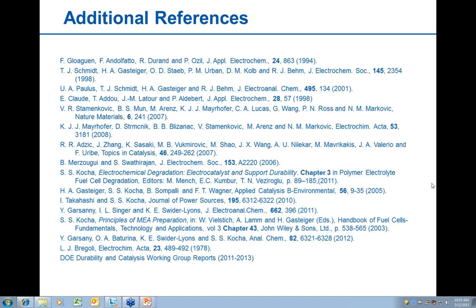Fine. And that's an interesting one. Can RDE be used for oxygen evolution reaction characterization? Yeah, that is a good question. For PEM fuel cells, we use glassy carbon discs on which we deposit the catalyst. So really you cannot take it to very high potentials. If you do, it'll start pitting and so on. Now, we also do some of the durability studies for PEMFCs on a gold disc.